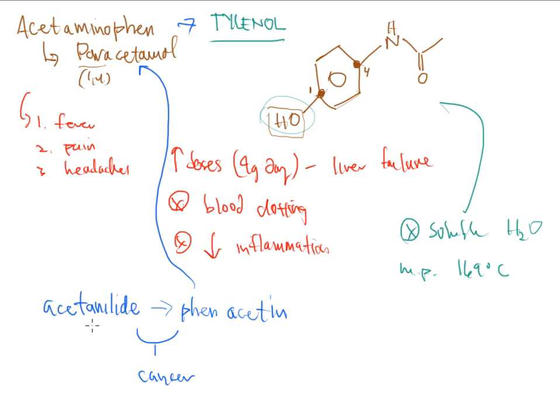And we have put it inside of your pill. And when you go through and calculate percentage, that's great. You can give us percentage of the unknown, and we'll check that number to see if you're close. But then they're going to follow up, and they're going to say, now in experiment number 3, a totally different one, you need to go through and you need to talk about how or why you determined your unknown to be one of these two. How did you do it? And why did you do it?